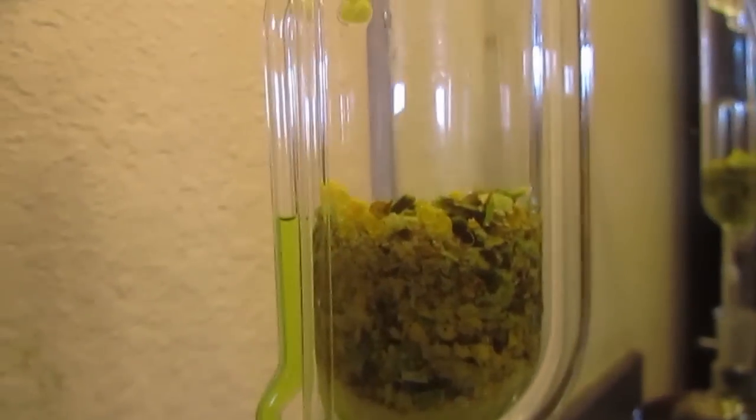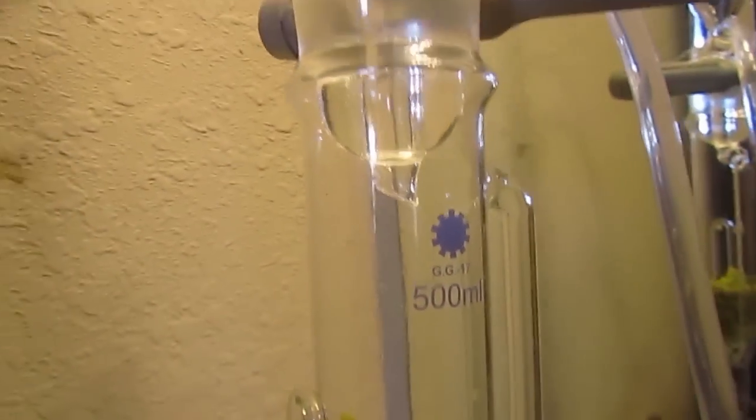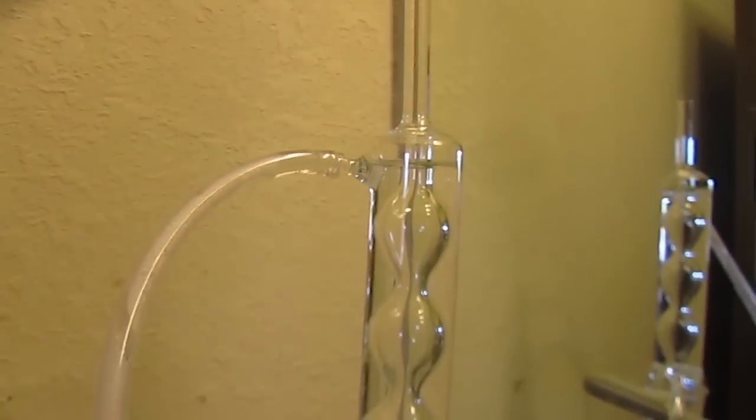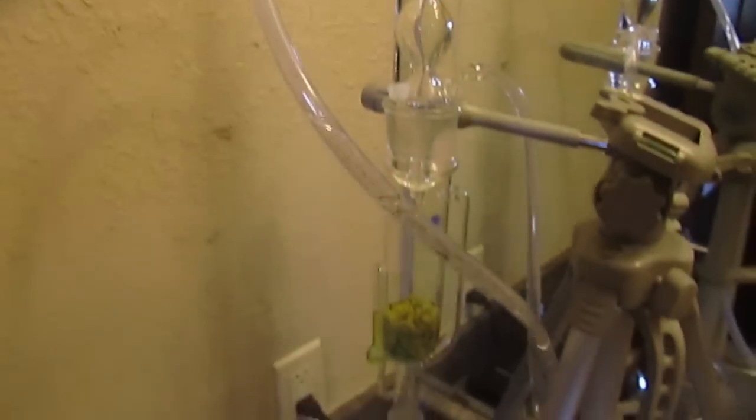I picked this up on eBay. It was pretty cheap — it was a good deal. And it came with a flask, an extractor body, and a nice condenser.